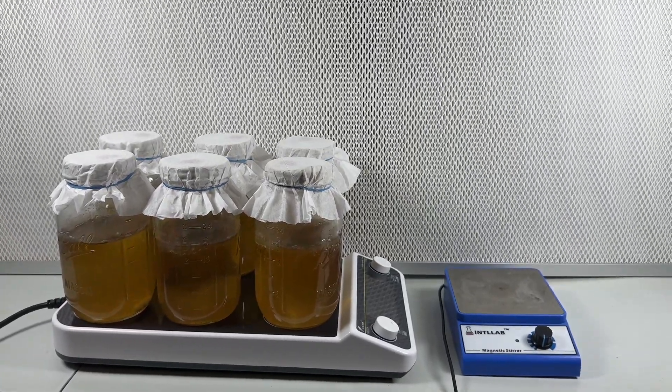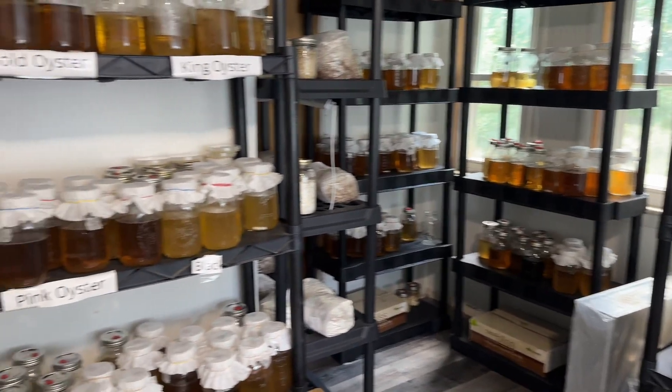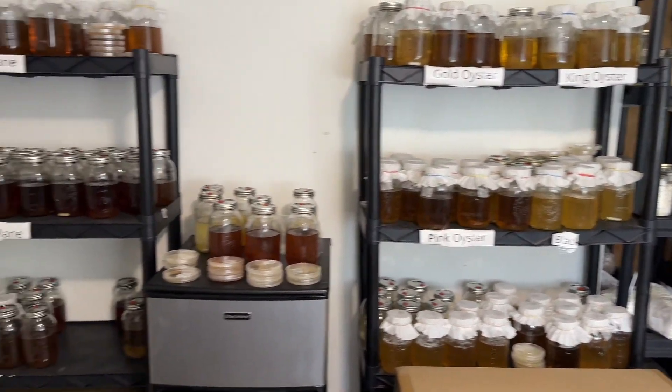As you can see from this clip, I basically filled up this entire room full of mushroom liquid culture jars, so having this magnetic stir plate is really going to make a difference.